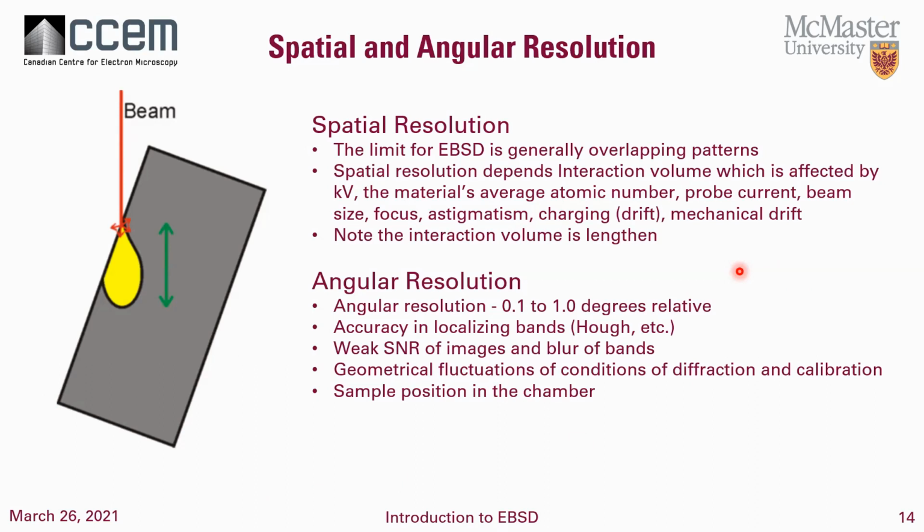Relatively, you can get down to fairly small angular resolutions, but it depends very much on being able to accurately determine the bands. The actual image produced by the camera is sometimes not very strong, without a lot of signal.